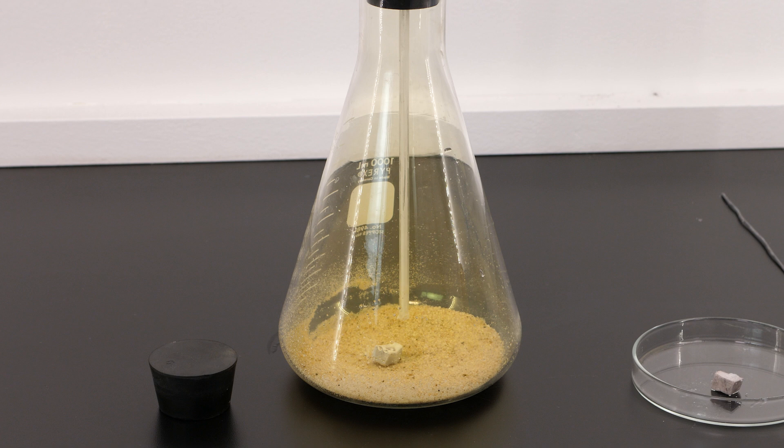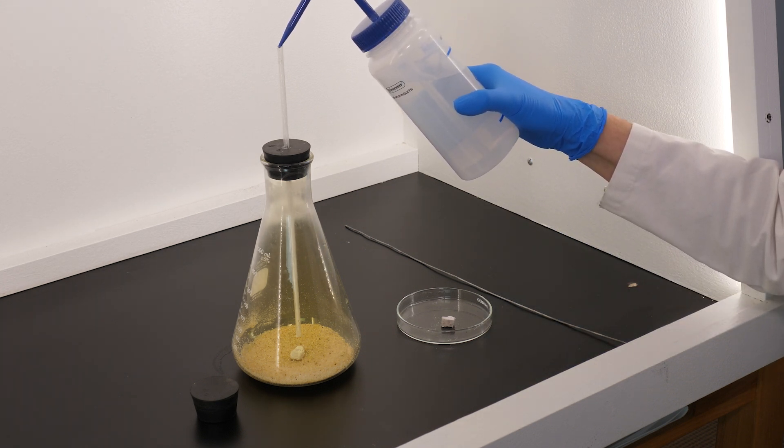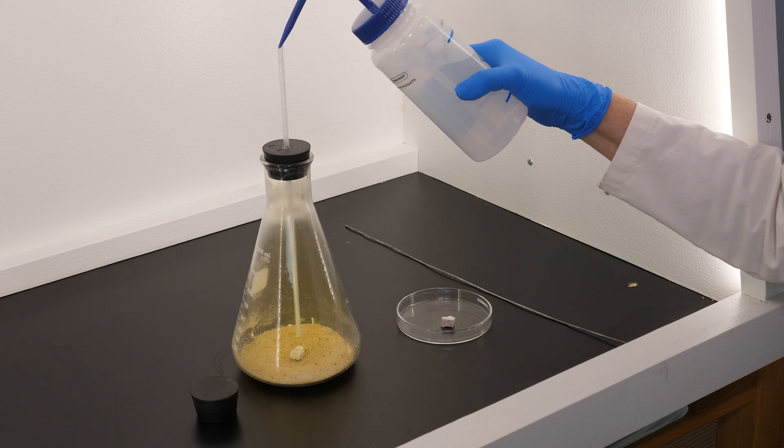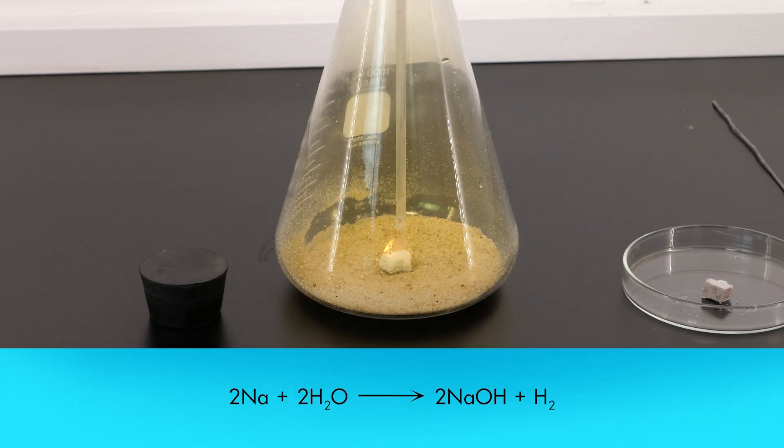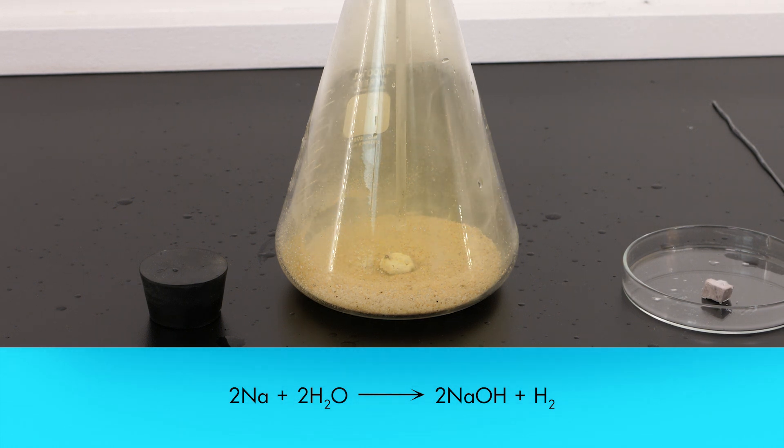Sodium must be in a liquid state before it will react with chlorine gas. To melt the sodium, we need to add a few drops of water through the glass tubing. The sodium will react with water to produce sodium hydroxide and hydrogen gas. This reaction will produce so much heat that it will ignite the hydrogen gas and melt the sodium.